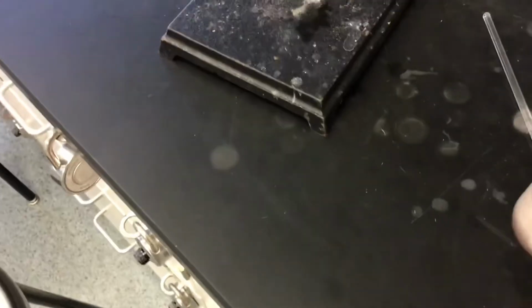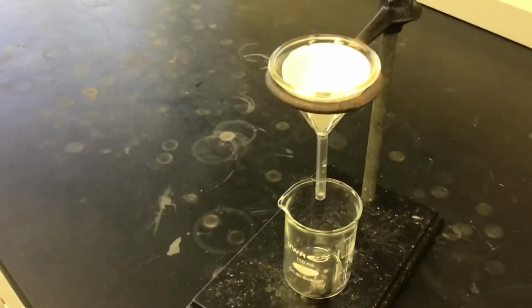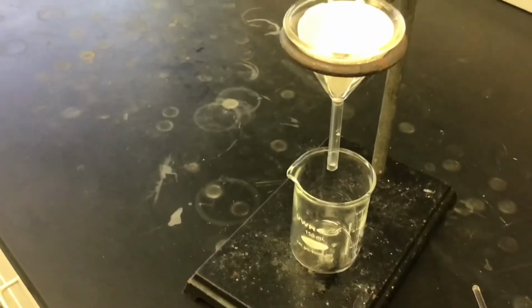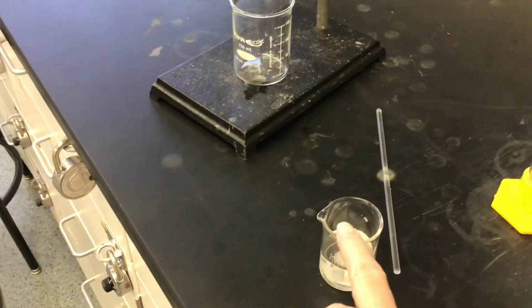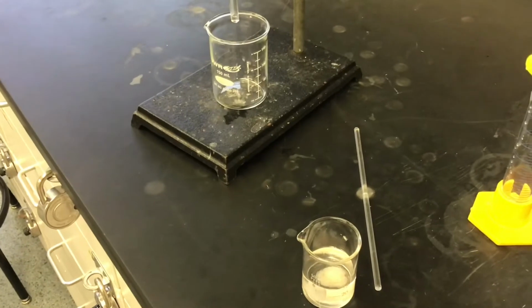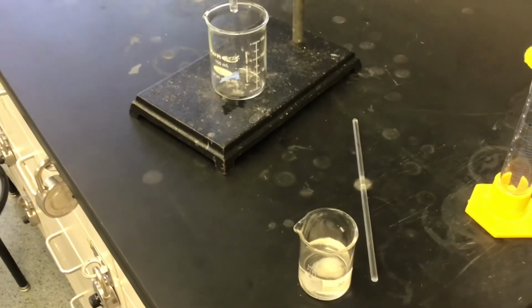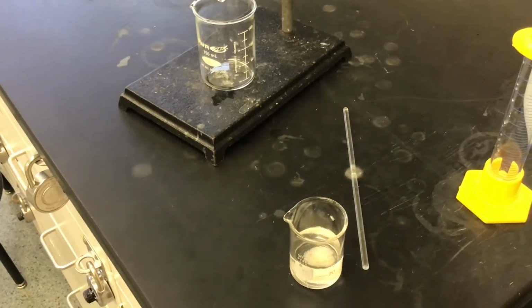Okay. And now that I've stirred it, we're going to assume that the salt has dissolved. Now I'm going to take your beaker 2 that we got the mass of and put it underneath this filter, the funnel with the filter paper in it, and I'm going to collect it. So at this point in that first beaker that we have right here, we should have the sand and the salt, and now that we've added water, stirred it, the salt should have dissolved in the water.